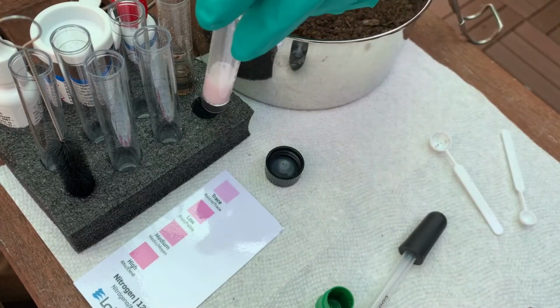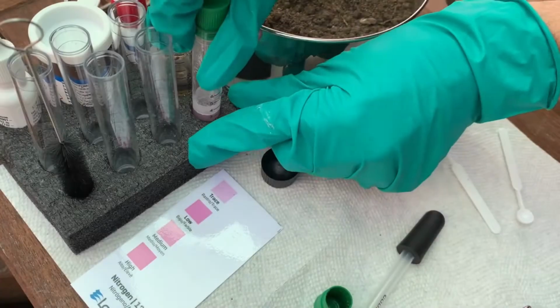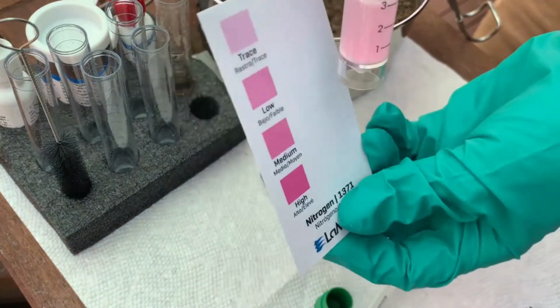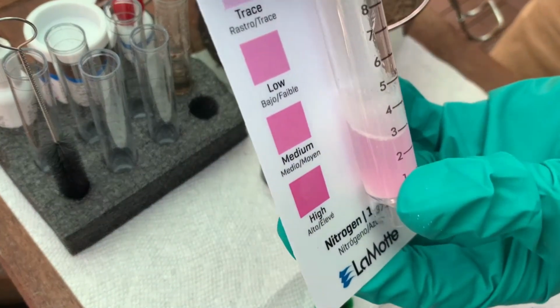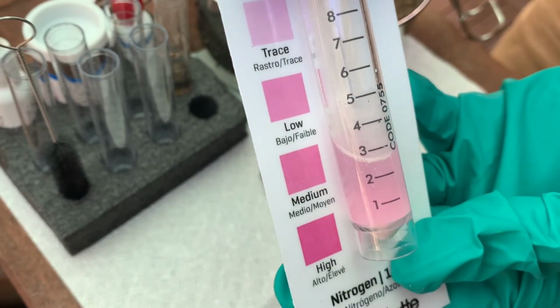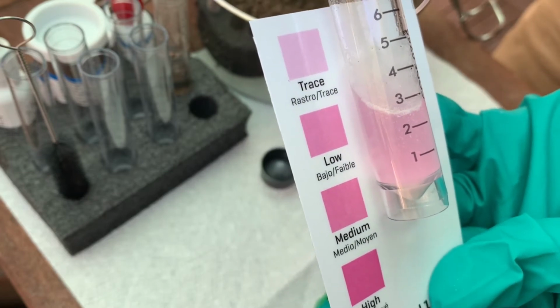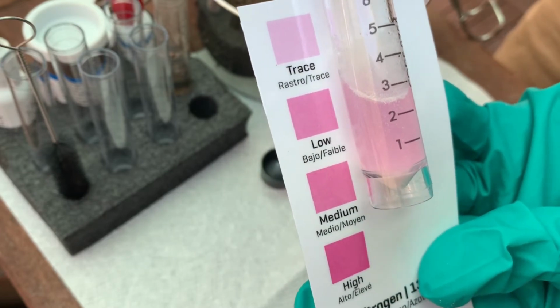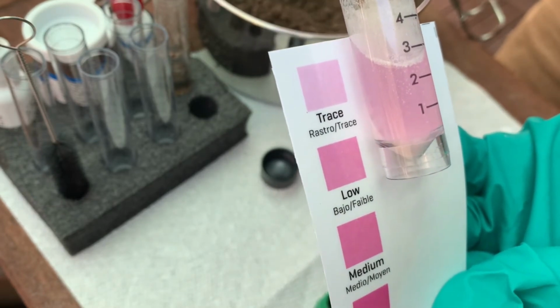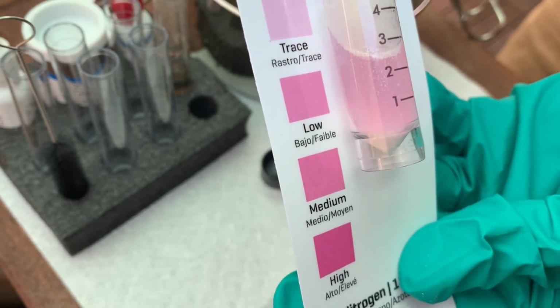Now you put it back and you wait 5 minutes for the pink color to develop. And this will be above the powder line. And then we hold our test tube up to the nitrogen color chart, and it's easiest when you compare it against 2 colors. You may say it's lighter than high, it's closer to medium. It's lighter than medium, it's closer to low. But it's darker than trace, and so it's somewhere between trace and low.